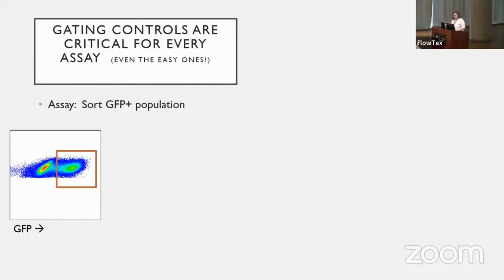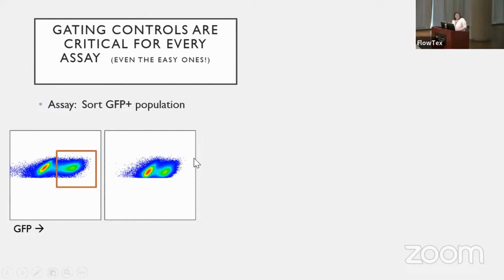All right, sample number 2. These are all just different variations. I don't really know what they did to the cells. Maybe different genes that they stuck in there. Again, I don't know. If you ask me without any other information, I'm going to be like, yeah, that looks positive and that looks negative. Yeah. We're going to put the gate there. Or, oh, I don't know. That's the same gate that I used in the first one. So maybe I should scooch it over a little bit because now maybe the negatives go there. The positives are there. Sure. Everybody okay with that?